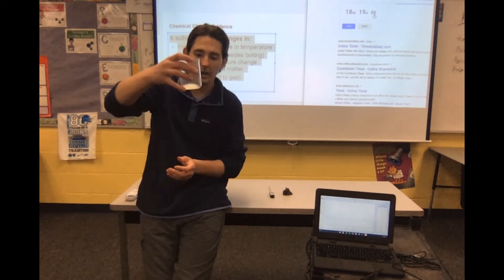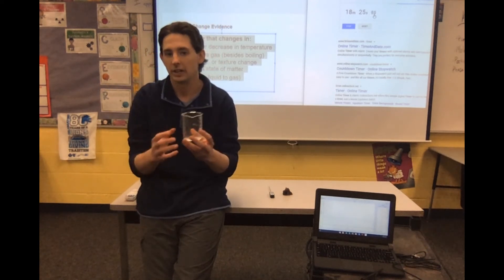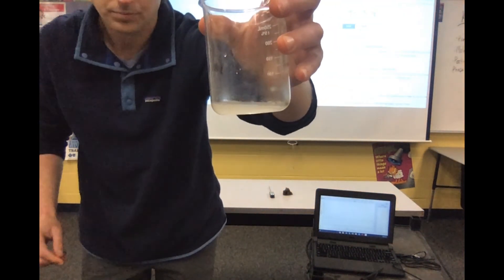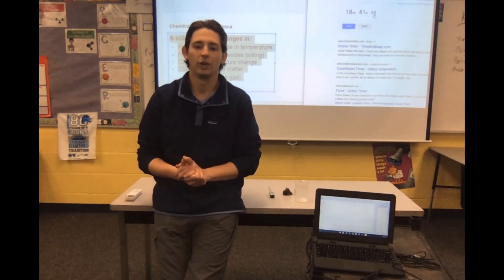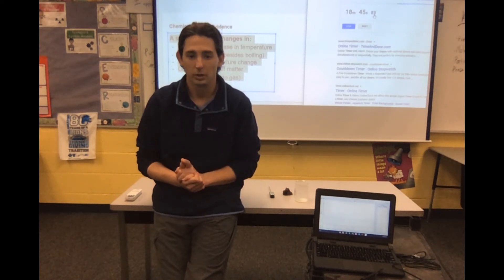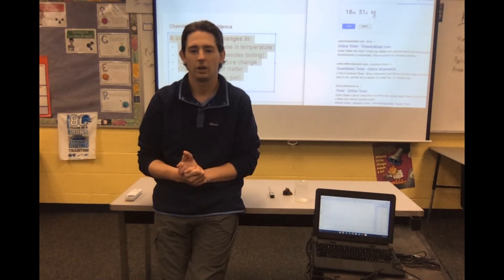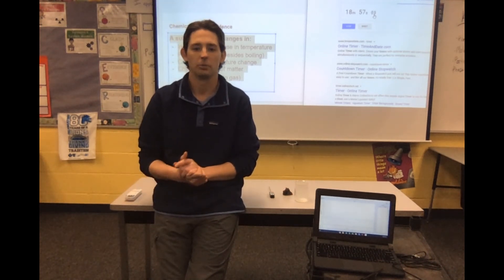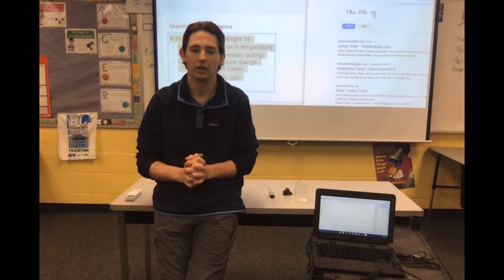And this endothermic reaction, again, another chemical reaction, the temperature decreased. So that is a sign of a chemical reaction. Also, it produced a precipitant that is along the outer edge of the glass. Hopefully you guys have a good understanding of the difference between endothermic and exothermic reactions. I hope your observations were clear. I hope you used what I had to say for these observations and the temperature. If you don't get the temperature 100% accurate because I was giving you Fahrenheit and Celsius, I know I should have been a little more consistent, but I wanted you to be able to tell the difference between Fahrenheit and Celsius. We are scientists.